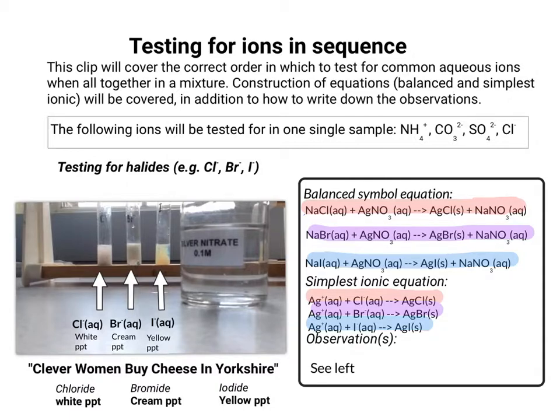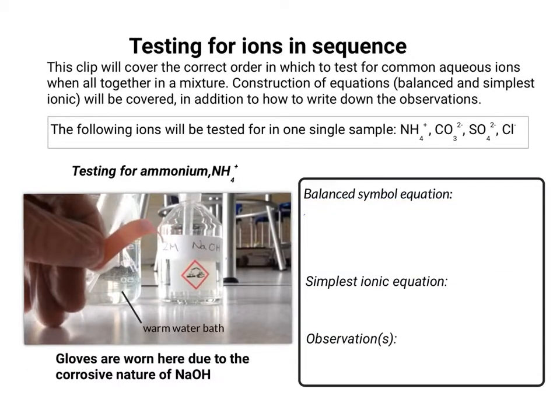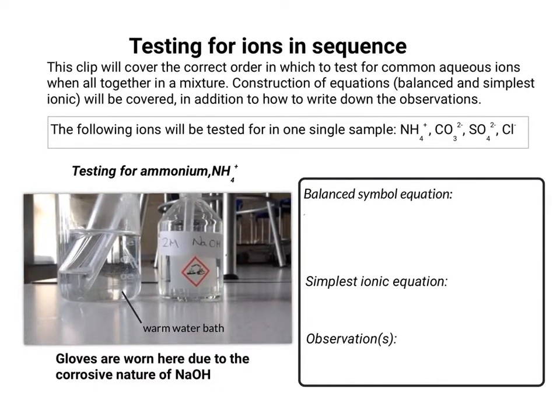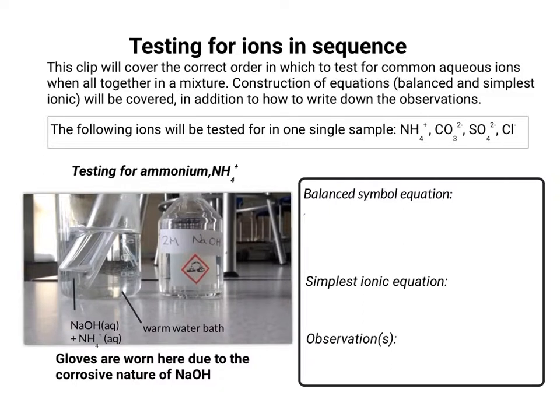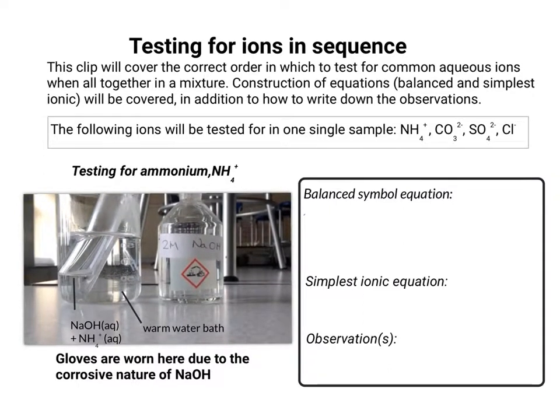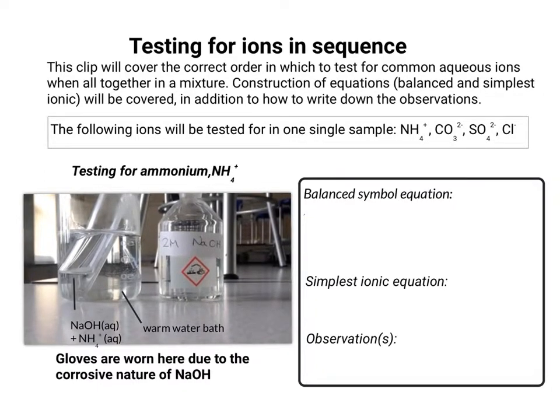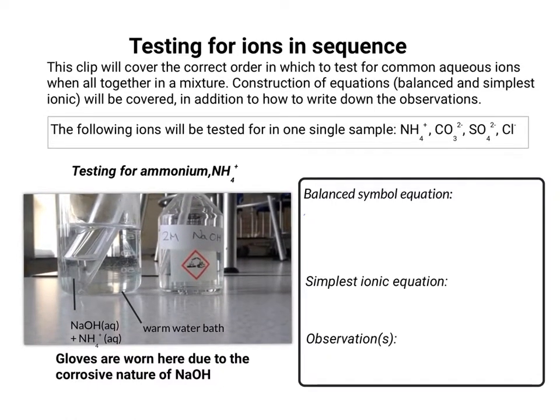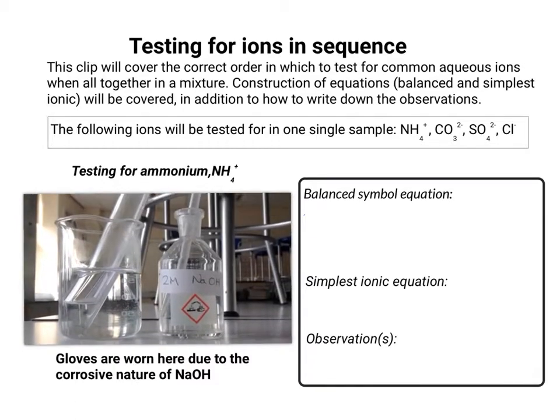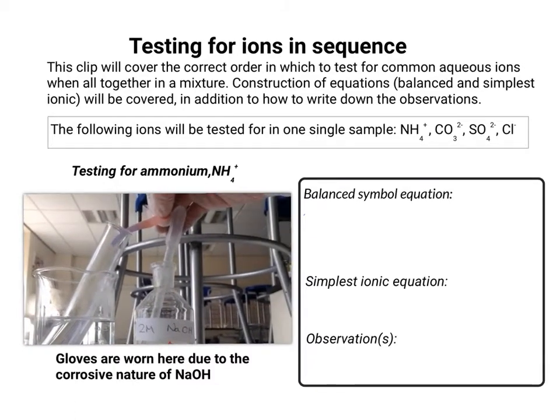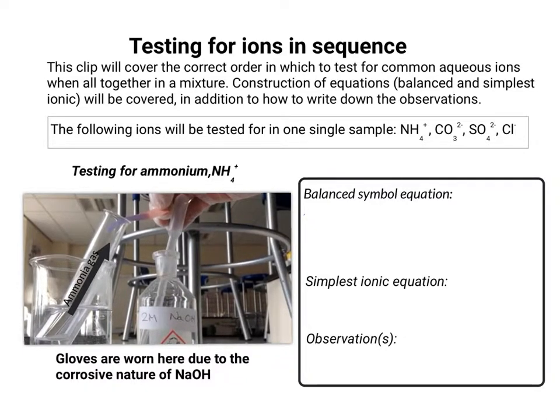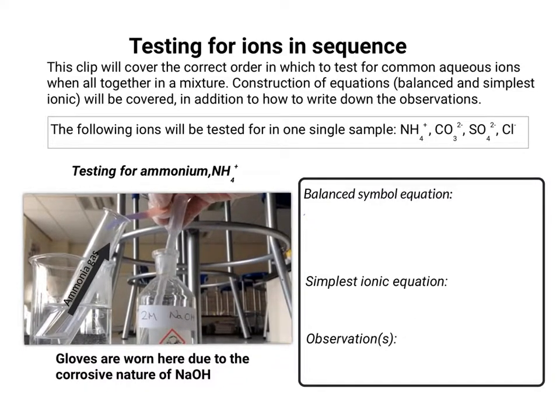Now for the final test: NH₄⁺, the ammonium ion. I have a piece of damp litmus paper — you can see it's damp where it's transparent — to test for ammonia. Normally this is done by gently heating with a Bunsen burner, but I'm using a water bath for safety. I add a little bit of sodium hydroxide. Ammonia is very soluble in water so you won't see much bubbling, but holding the damp litmus paper at the top of the tube, you can clearly see it's gone quite blue, showing that something alkaline has been given off — that is the test for ammonia.